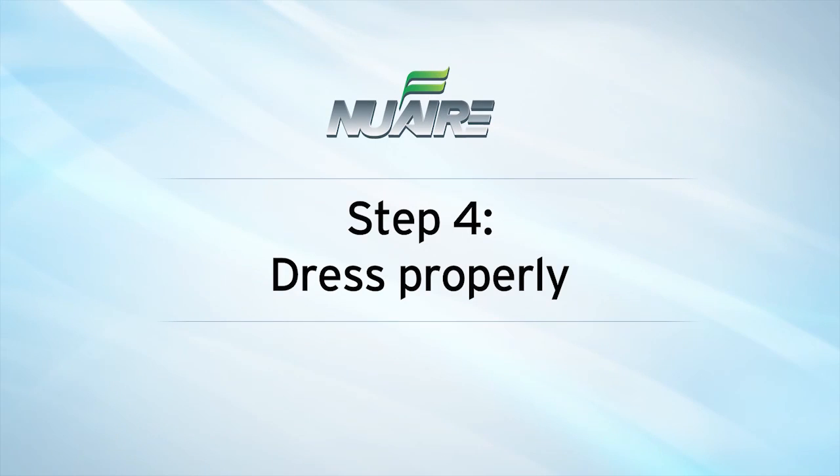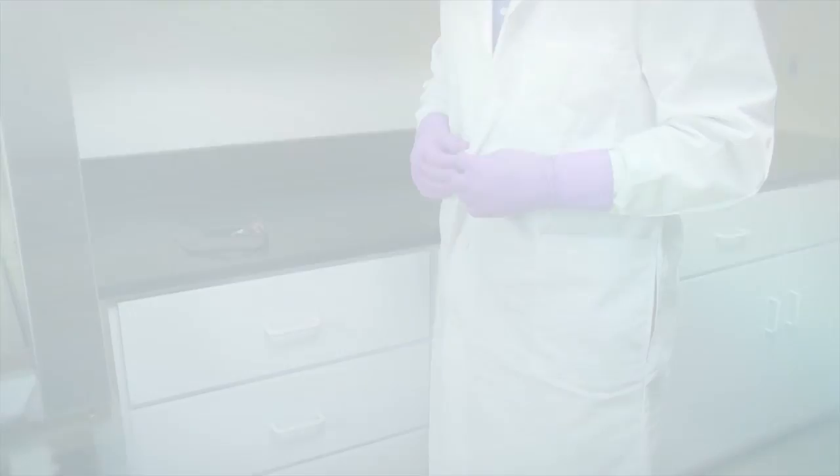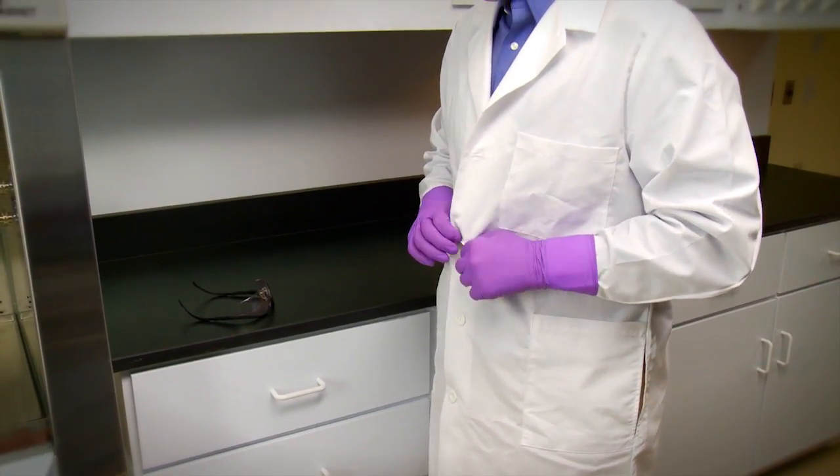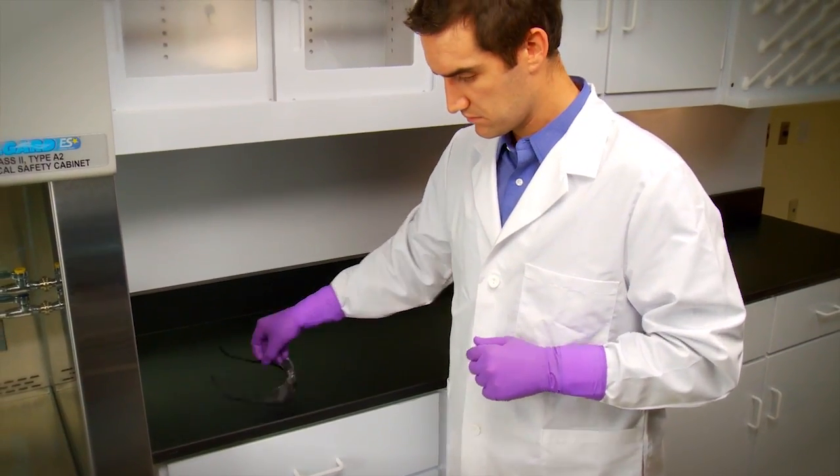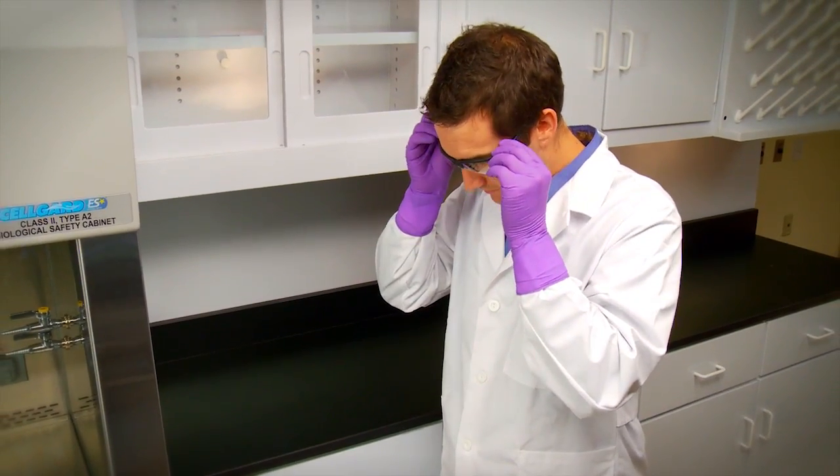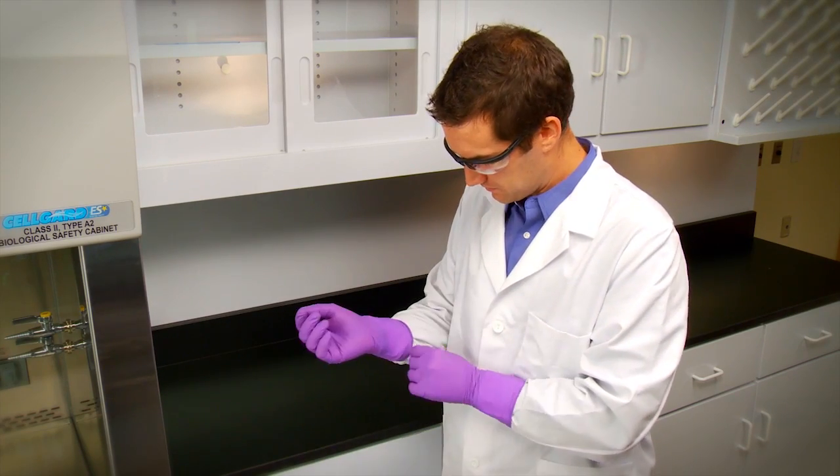Proper dress is another essential for protection of personnel, product, and the environment. Laboratory coats should be worn buttoned over street clothing. Protective eyewear should be on at all times, and latex or nitrile gloves are necessary when handling culture, contaminated surfaces, or equipment.